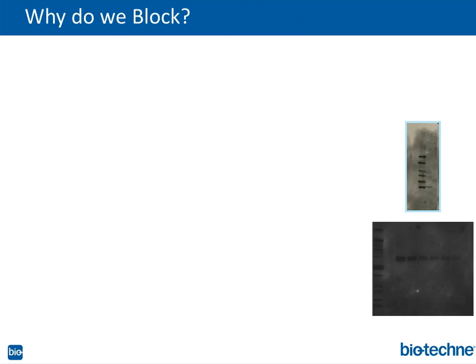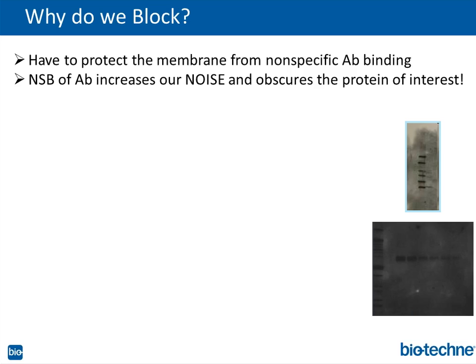Okay, let's launch right into blocking. Now, again, a lot of this is trial and error. I'll be honest with you, there's no magic bullet here, okay? What works for one person and one antibody may not work for somebody else. So why do we block? Obviously, I showed you the pore structure of the membrane. There's a lot to block there. We want to block the non-specific stuff, because it's all about preventing noise.